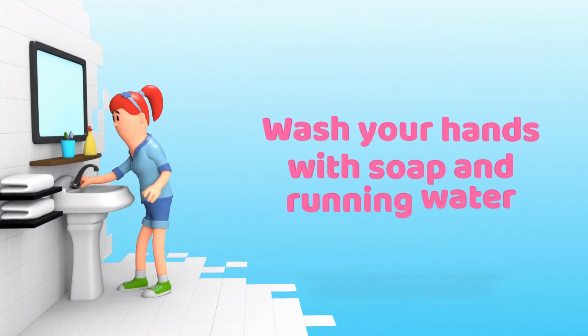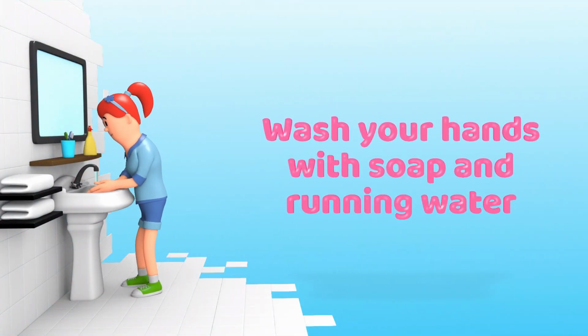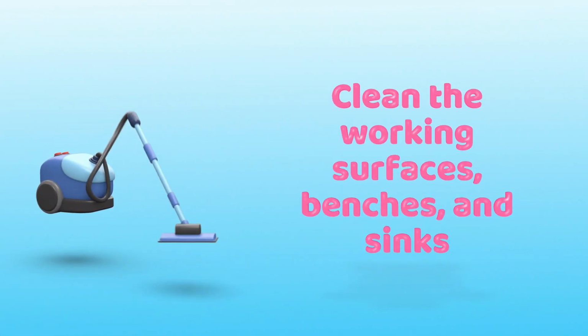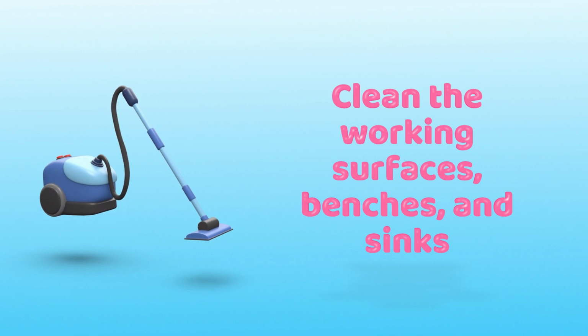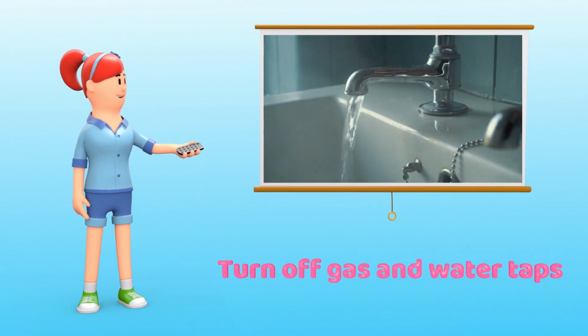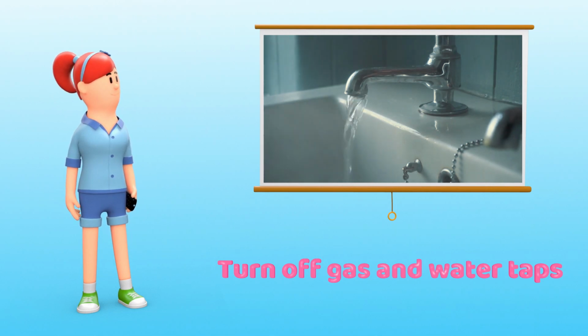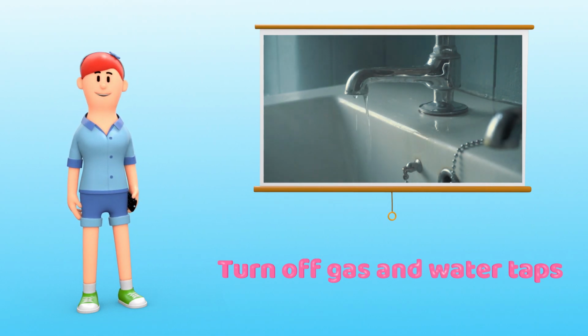Immediately after finishing your practical, you must wash your hands with soap and running water. After you are done with your experiments, make sure you clean the working surfaces, the benches and the sinks which you used for experiments. After finishing your experiment and cleaning the laboratory, you must turn off the gas and water taps which were used during your experiments.